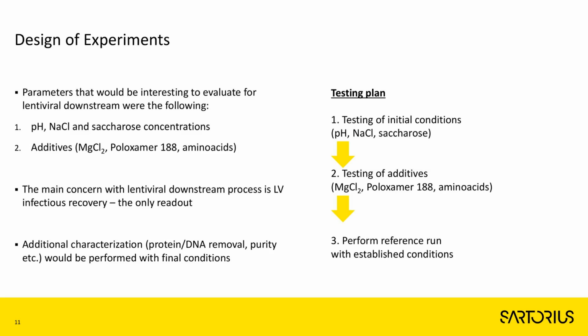The main concern with the lentiviral downstream process for us was the lentivirus infectious recovery. And as such, this was the only readout that we were focused on during the optimization process. And any additional characterization would then be performed once the final conditions have been set up and reference run with the established conditions performed.